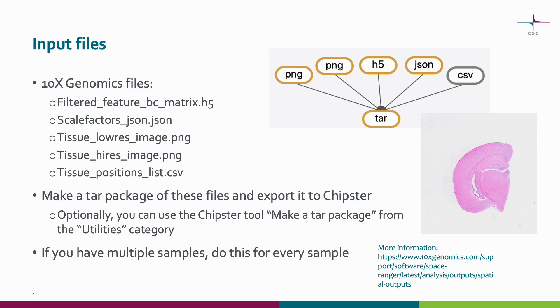You can find the tool in the utilities category. Note that if you have multiple samples, you need to perform this step separately for each sample.